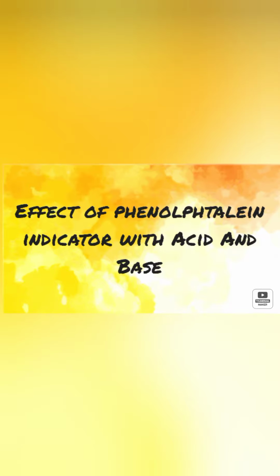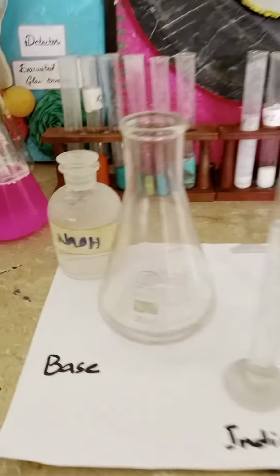Today I'm here with a very interesting video, the effect of phenolphthalein indicator with an acid or a base. As you all know, phenolphthalein is a very important indicator in titration reactions. So I'm going to elaborate on this point here.